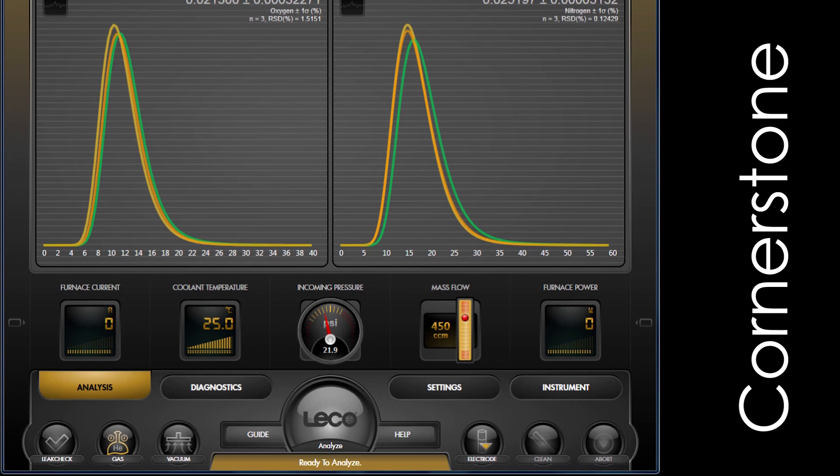As you can see, this software is divided into four main sections — analysis, diagnostics, settings, and instrument — for simplified navigation and organization.